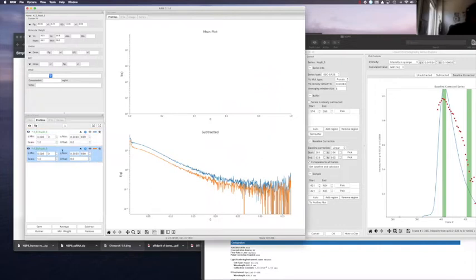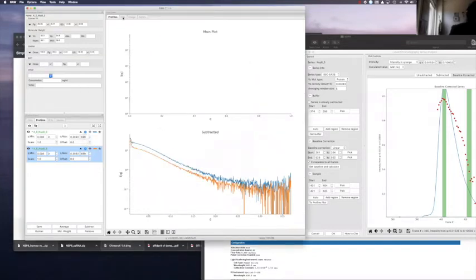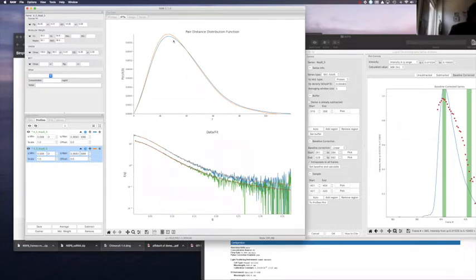You can also calculate the P(r) function for the shoulder of the peak. Okay, this is again a little bit at the beginning. We'll just truncate these few points here. Why not? If the particle is relatively small, you don't need those points. And now, when you go to the top in the IFT, you will see the comparison that indeed the shoulder is a little bit smaller in the Dmax, and is also less broad. And these are the fits from GNOM.